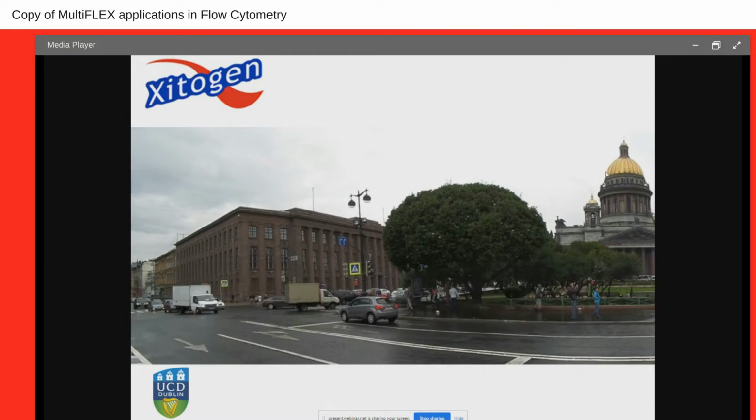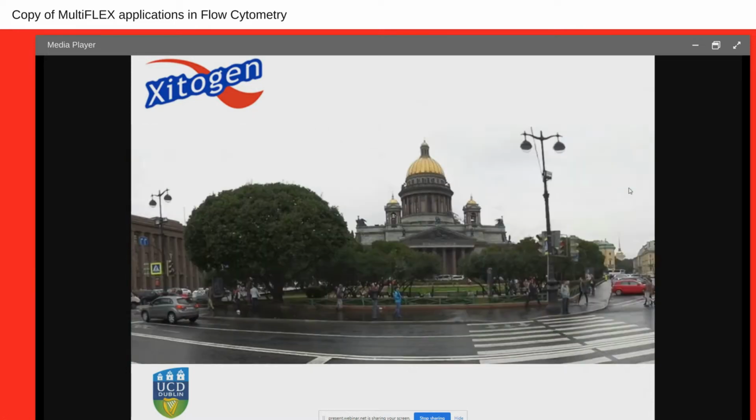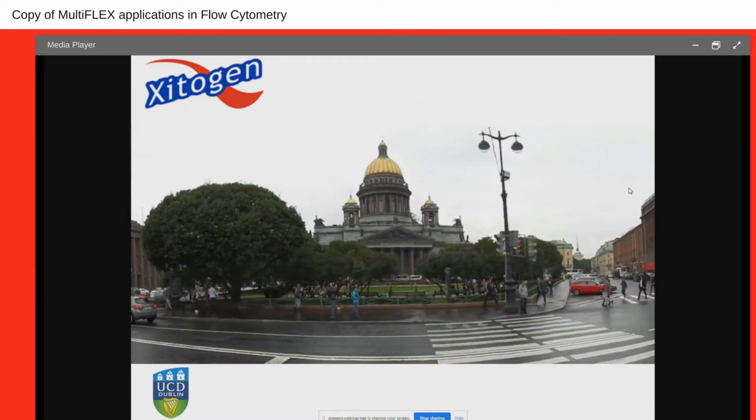And look at this cathedral. This is in St. Petersburg. You can see that cathedral there, but it looks like it's off screen. We would like to have that one in the center of the screen. So this dynamic range, with the possibility of fine-tuning, what it allows me is basically to drop down the gains and put that signal exactly where we want it.